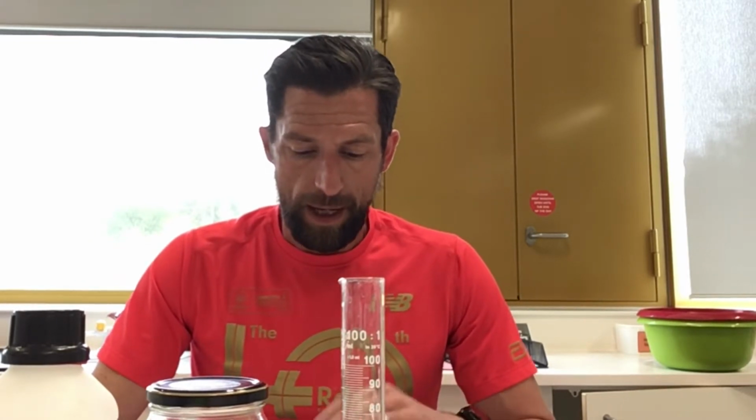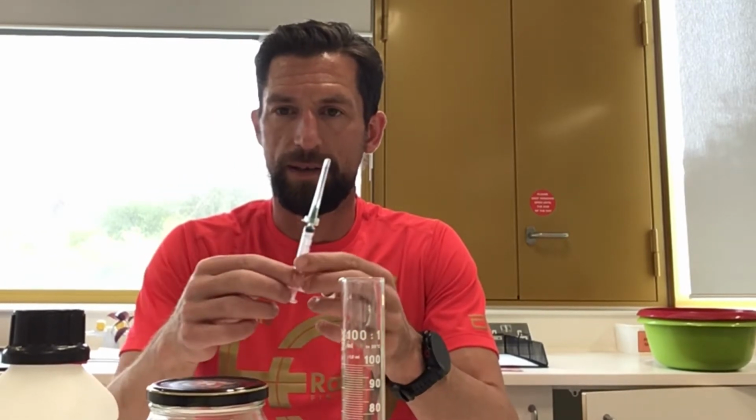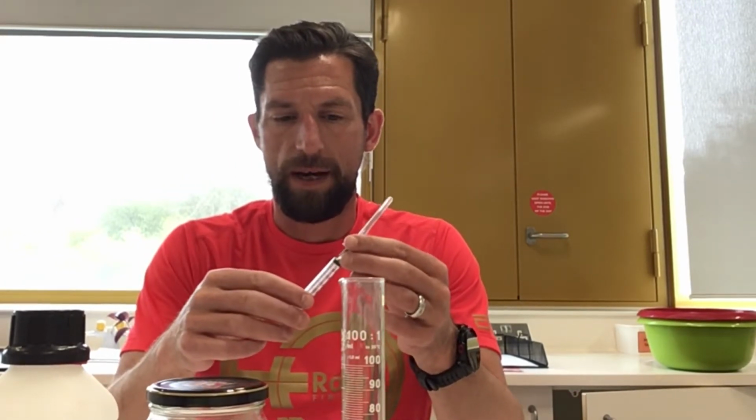The trouble with making the formalin is it actually has a pH of 3 to 5, so it's quite acidic, so it can remove the colours if you don't neutralise it and make it buffered. So I'm going to make the formalin, and then what I need to do is use this hypodermic needle. I'm going to do all this outside because the formaldehyde is carcinogenic and toxic if inhaled. And I'm going to use this hypodermic needle to inject the specimen, the snake, with the formalin.